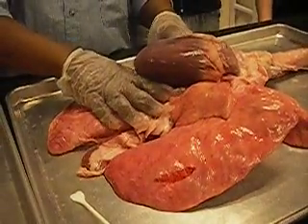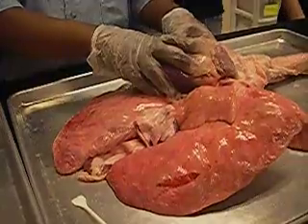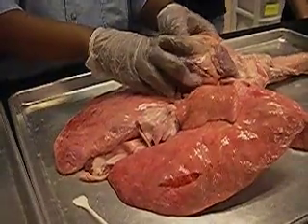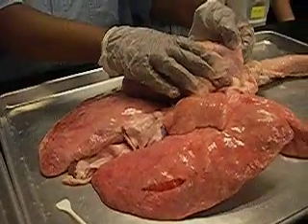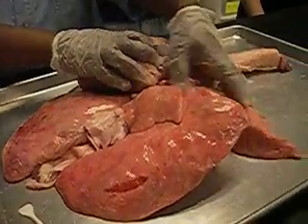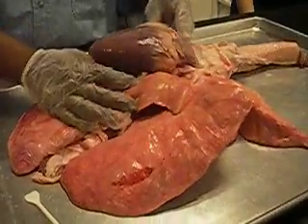Lung, the pulmonary artery. So that is which side of the heart? The right. Right. Okay. So this is the right side, and that is the pulmonary artery that goes to the lungs. Okay. Pulmonary is on the right.